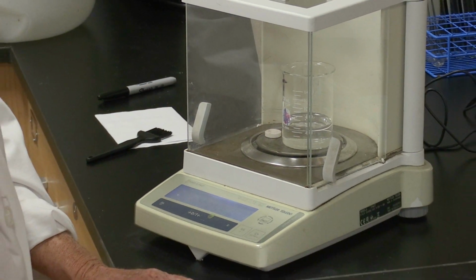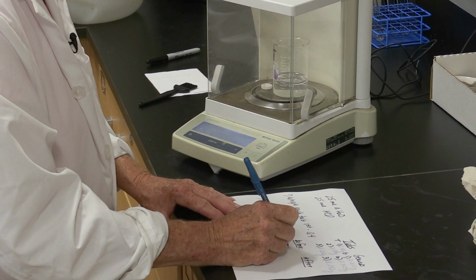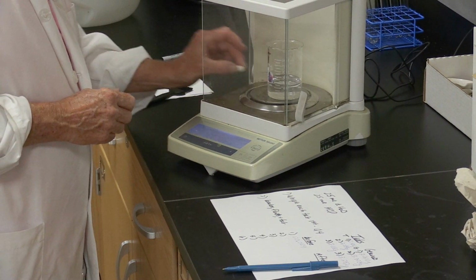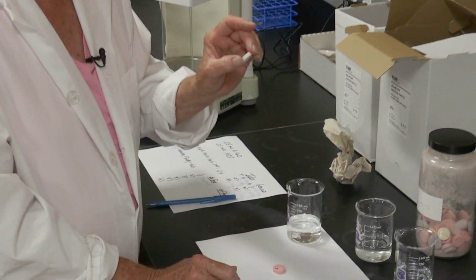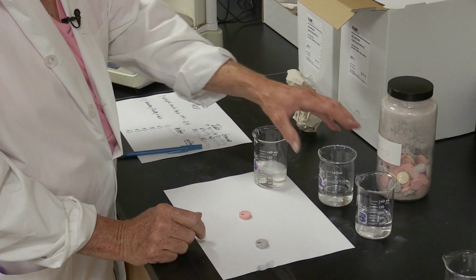So the weight together is 120.059 grams. And we could put the tablet in each beaker as we go along. So one is going in one.